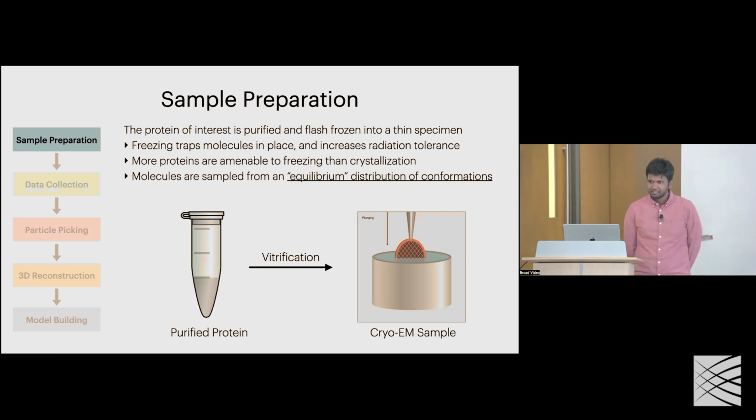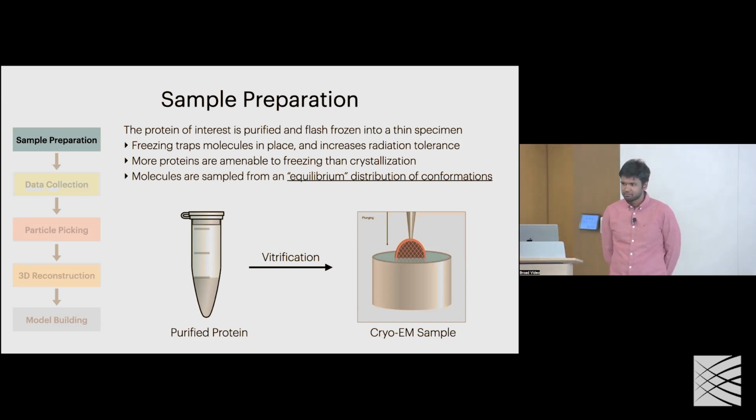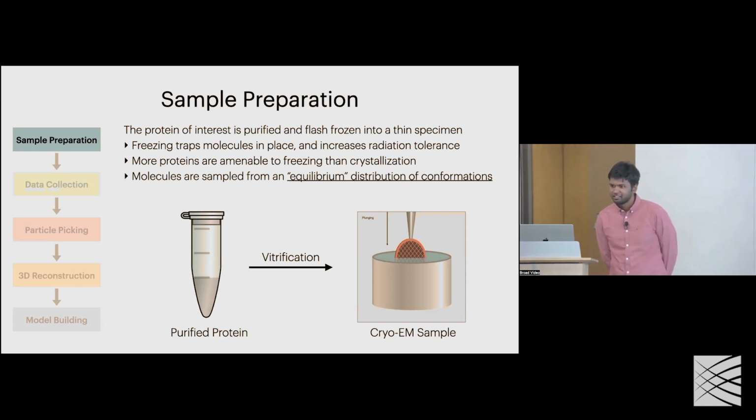So for X-ray crystallography, I've heard of it in the context of individual proteins, being used for proteins to determine structure. But is it done on a cell level like cryo-EM is? Or am I confusing it with something else? Sorry, could you repeat, on what level? So with cryo-EM, you take cell level images, right? Do you get that for X-ray crystallography as well? Or is it for molecules, not the whole distribution of different proteins in the cell?